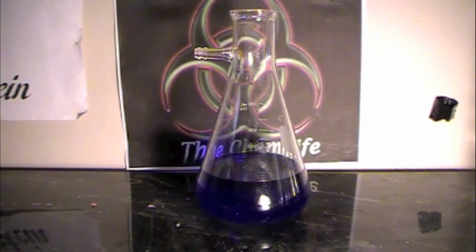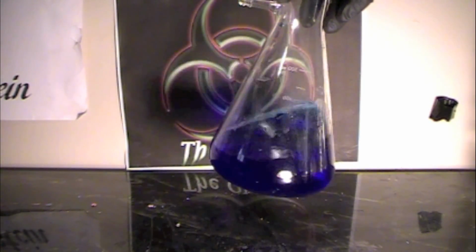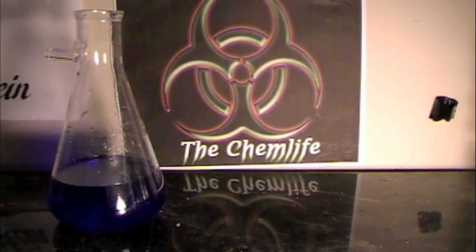Next, add about a gram of copper sulfate, and you'll see it immediately turn this very, very dark blue color instead of the more pale blue of the mush beforehand. If necessary, you can add ammonia if you see copper hydroxide starting to form. After about a month, filter out the solution so you have this perfectly clear blue liquid. This is the complexed cellulose in the Schweizer's reagent.